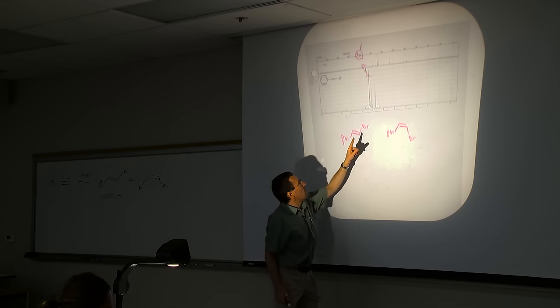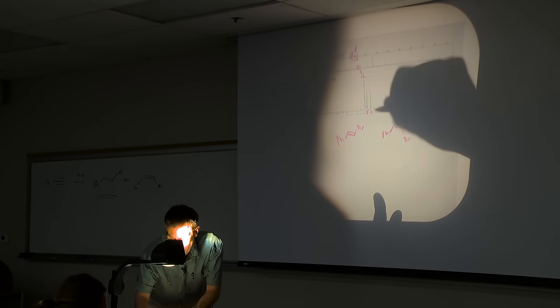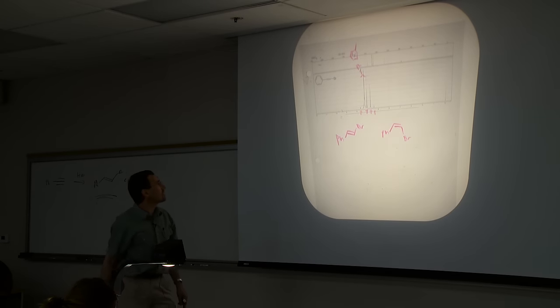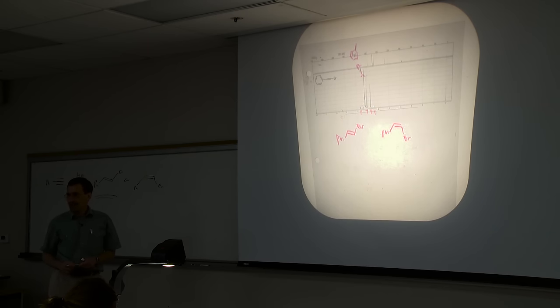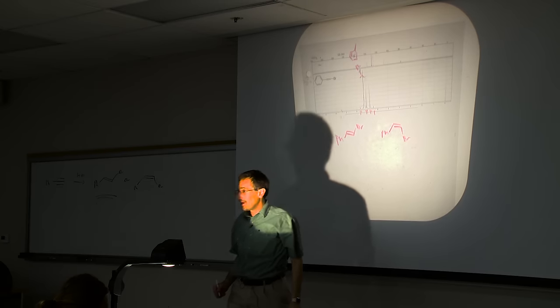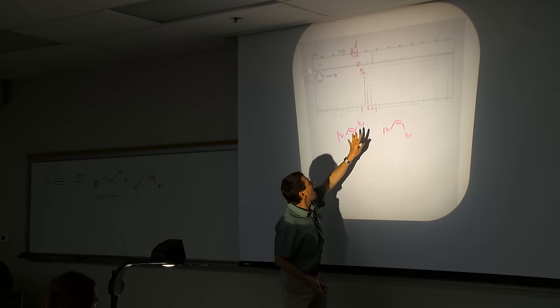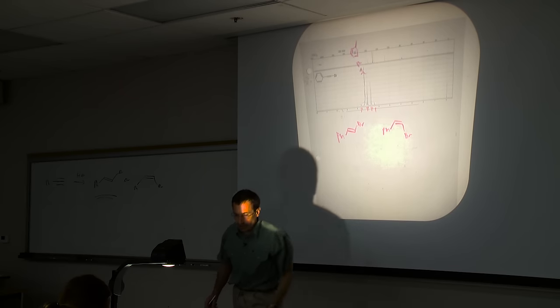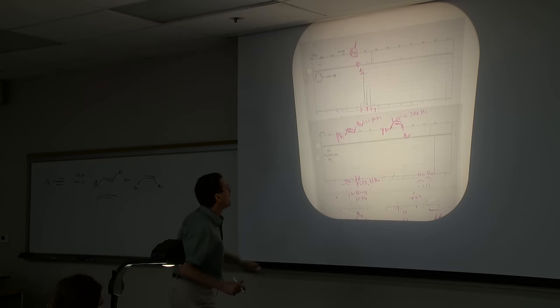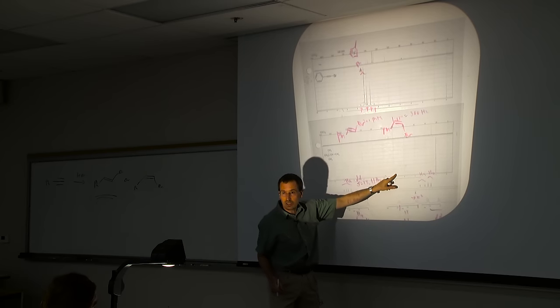But then we've got a couple of more peaks here, a couple of peaks here, and a couple of peaks out here. Can you see those patterns? What do they look like? What does that peak look like? It looks like a doublet. I haven't gone and put a ruler on this particular spectrum. You actually, of course, have an example of what 10 hertz and 18 hertz look like from your couplings over here. This distance is 18 hertz. That distance is 10 hertz. So you get a little bit of a calibration.